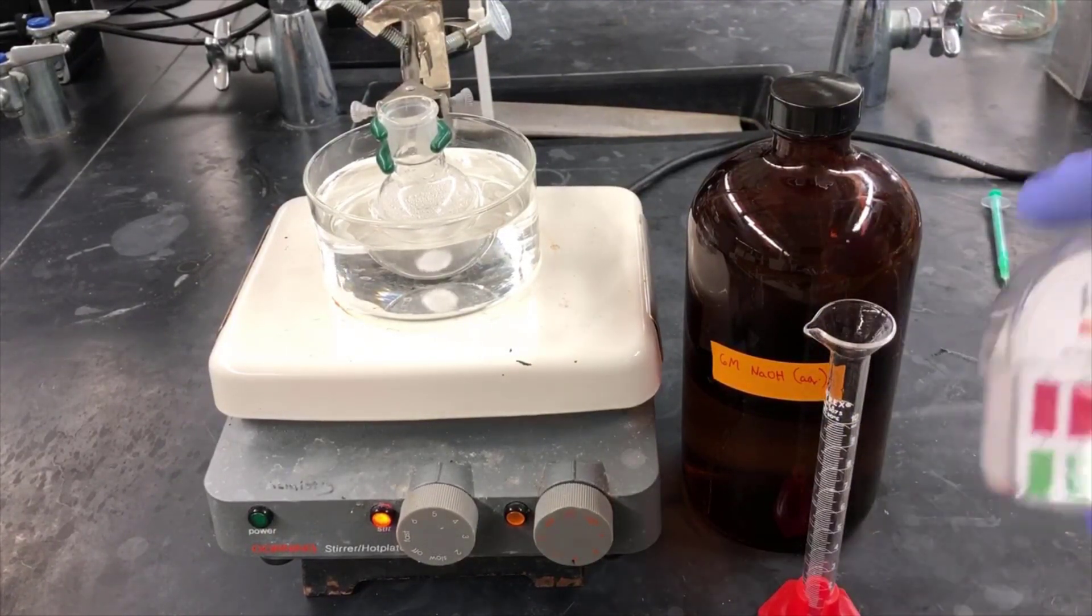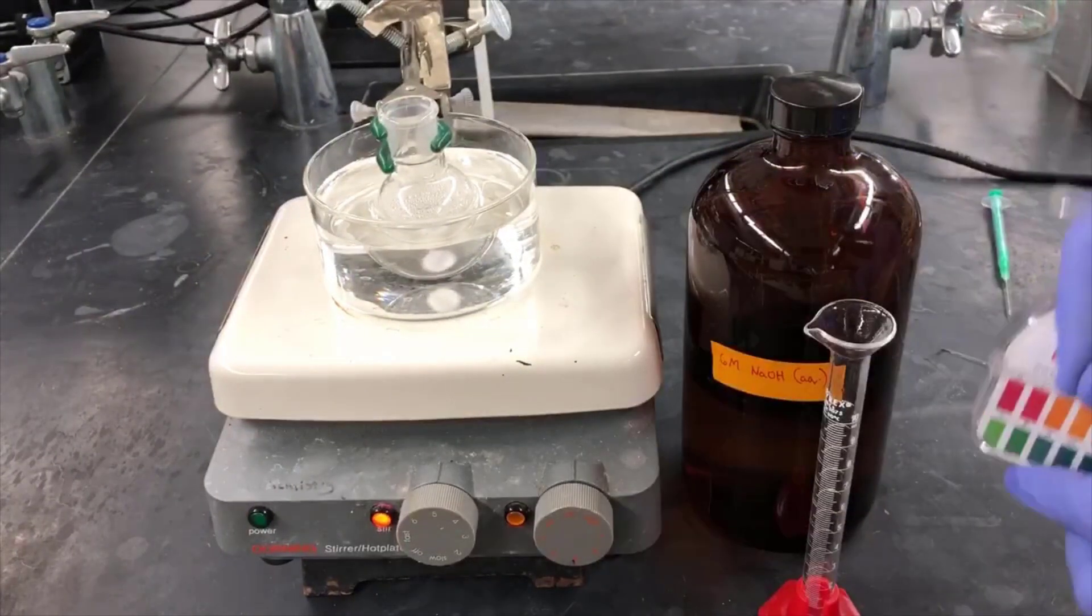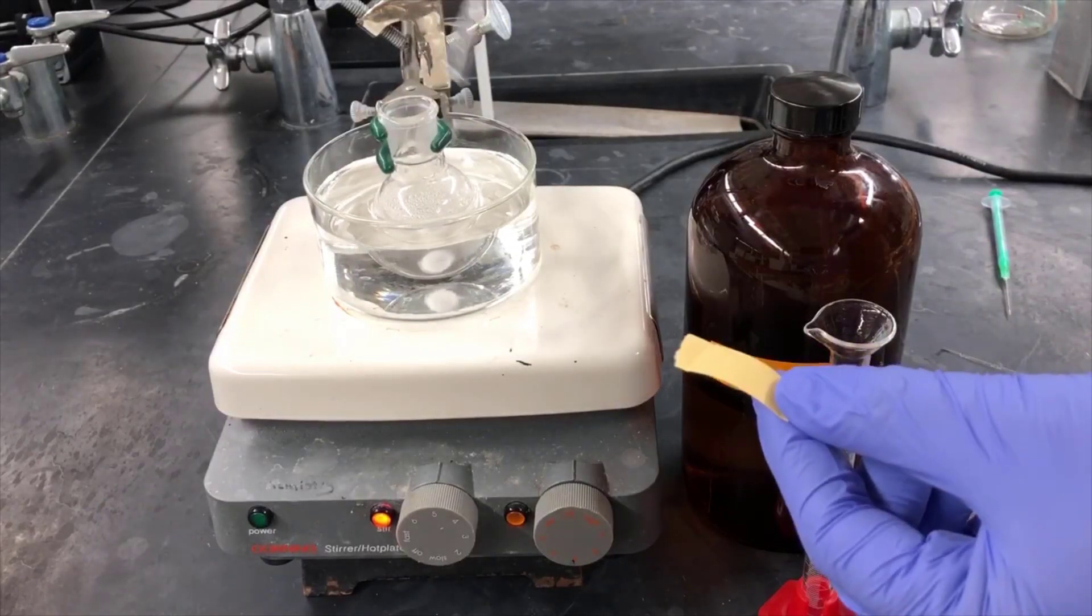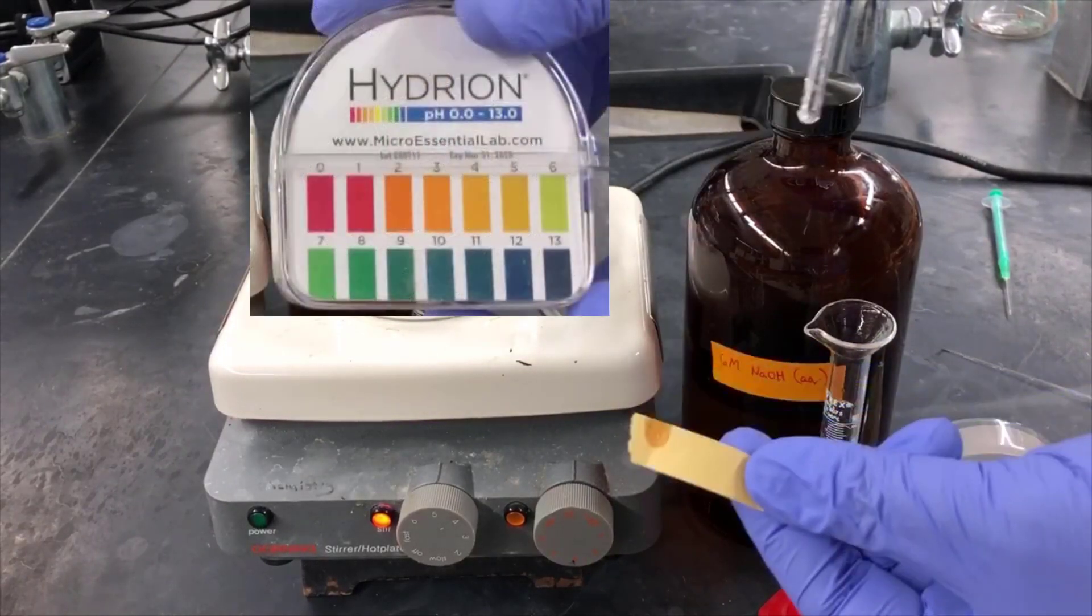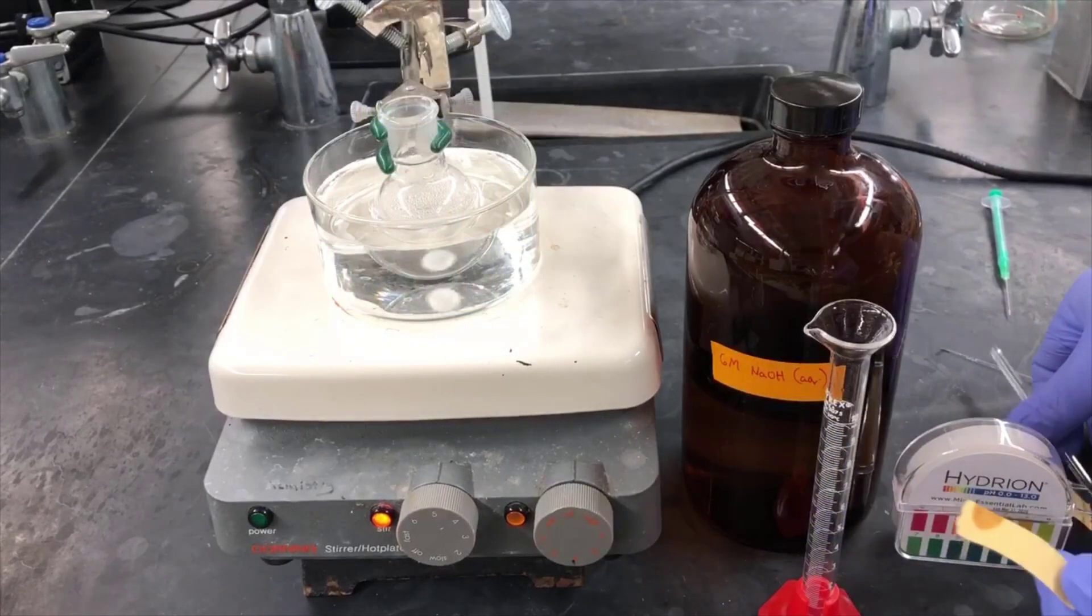We'll use pH paper to test the pH of the solution. We want the solution to be basic so that we can be sure all the acetic acid has been deprotonated. I'm dipping a glass stir rod in the solution and touching it to the paper. The orange color indicates a pH of about 4, which is still acidic. We're going to have to add some more sodium hydroxide and test again.